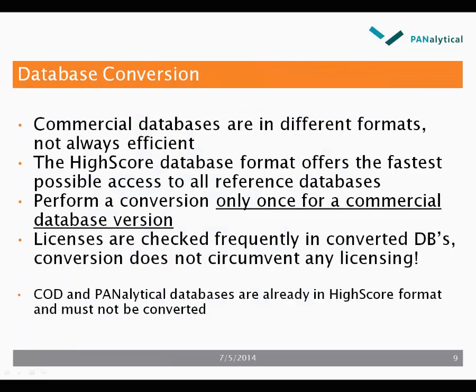Commercial databases are in different formats, not always efficient. The Highscore database format offers the fastest possible access to all reference databases. You need to perform a database conversion only once for a commercial release version. Licenses are checked frequently in converted databases, so conversion does not circumvent any licensing.